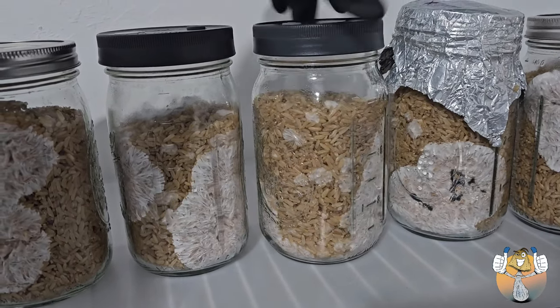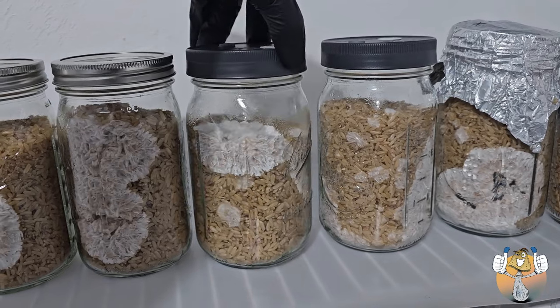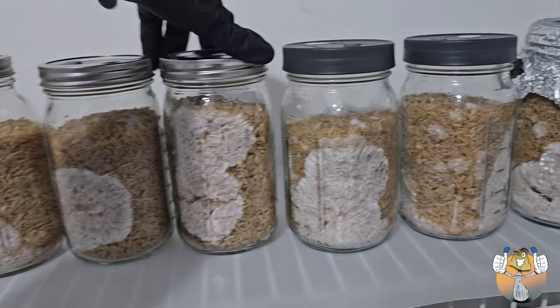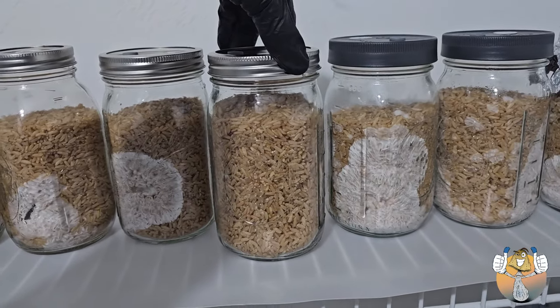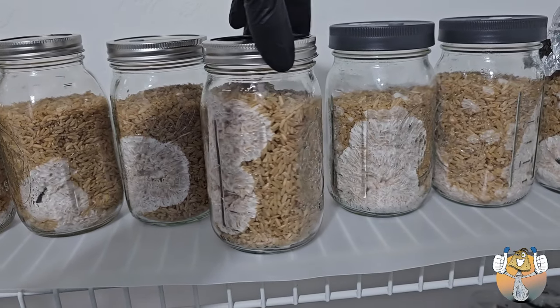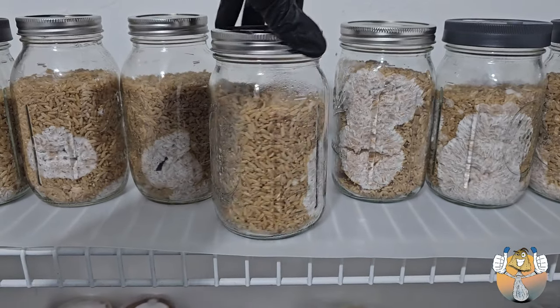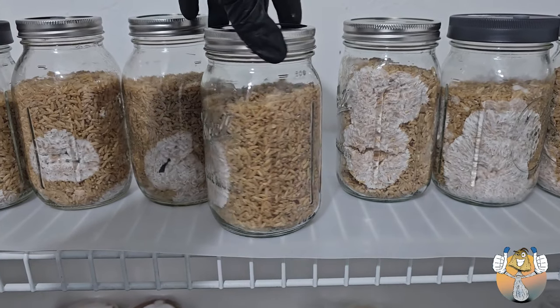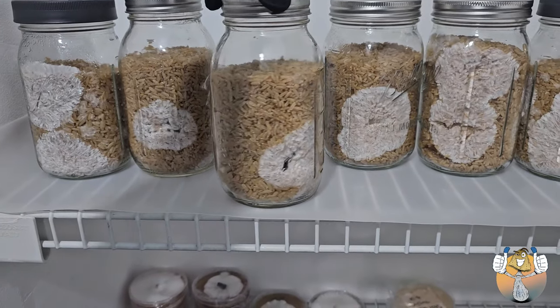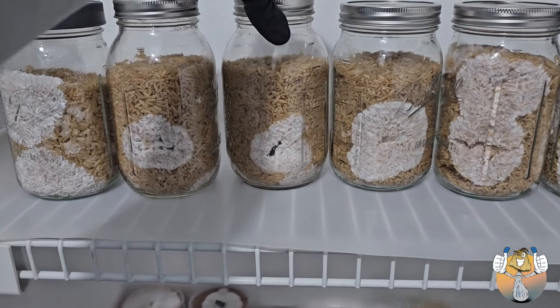It's definitely a dope feeling knowing that you can provide yourself with all that you need for your at-home mycology. Because this is a big thing for those that work on a budget. If you can get your hands on a pressure cooker and some brown rice or popcorn or whatever grain you choose, and you follow the techniques that others set out or whatever you find from your research, and you can provide yourself with everything that you need, that's dope. So this is a good feeling.